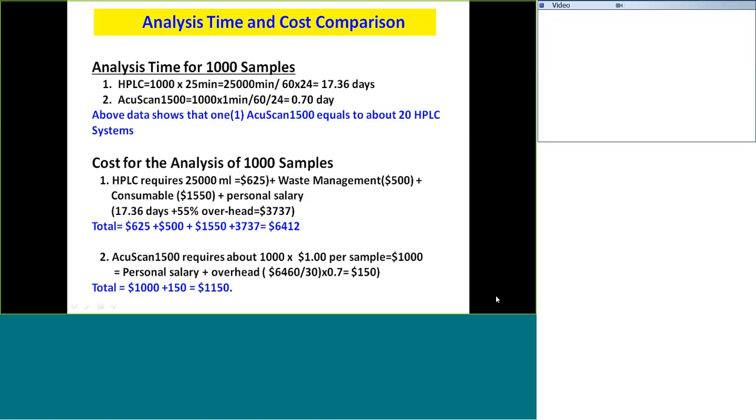And so if the drug company brings the data to the FDA, they can say our product meets the compliance regulation from a data handling point of view and from the method assurance point of view. Also, the levels of authority, whether administrator, director or operator, each have their own level of what they can do, like method changes or changing parameters. That is saved in the logbook. So at the moment, the system meets the compliance, but it isn't yet certified by the FDA. That could be coming soon.